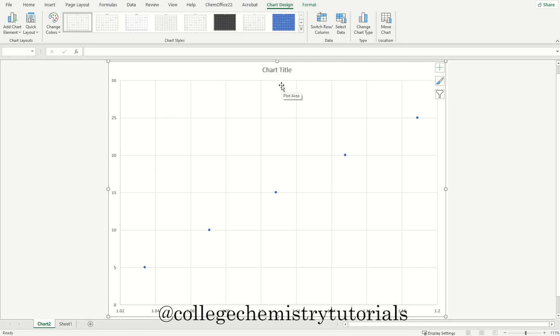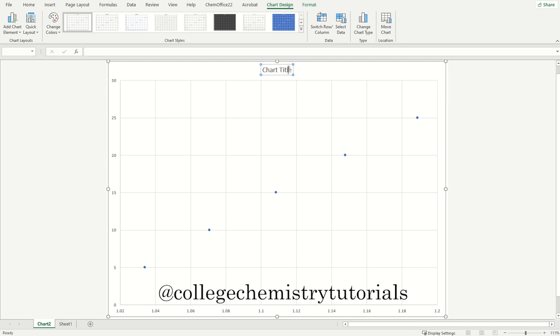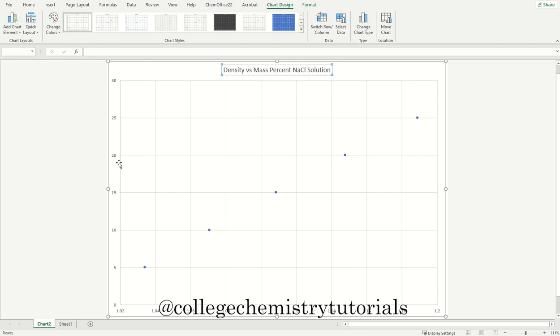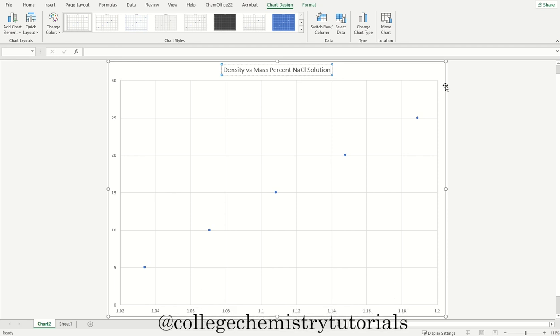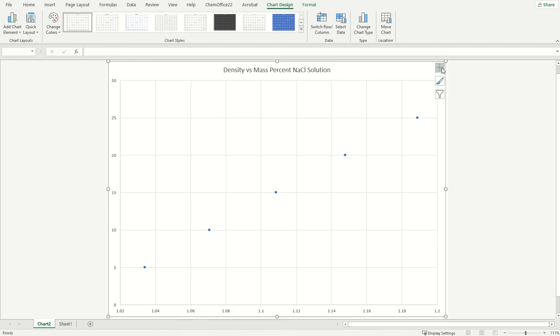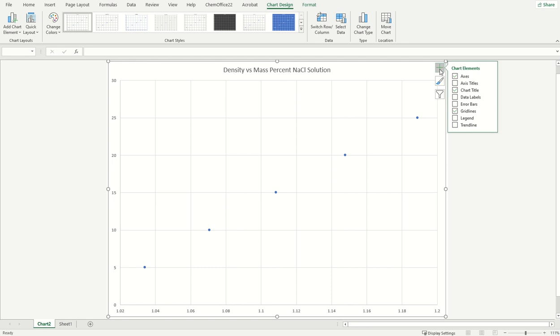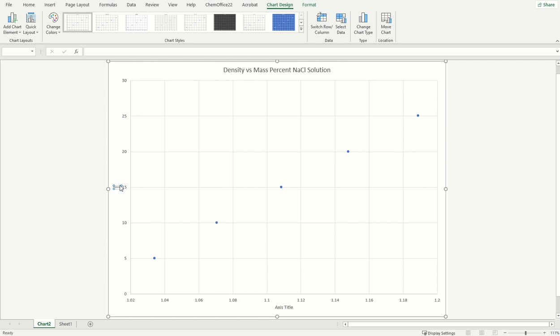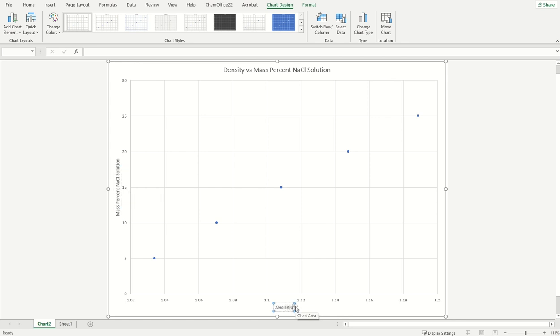So it looks something like this. There's a couple things we can do here in Excel. We can actually change the title. So I'll call this density versus mass percent of a sodium chloride solution. In Excel we can actually go to this plus sign right here, and we can actually add axes titles. And to be professional, we do want to label what we can here. So we'll call this the mass percent sodium chloride solution. And then our x-axis is the density, and we'll call this in grams per milliliter.